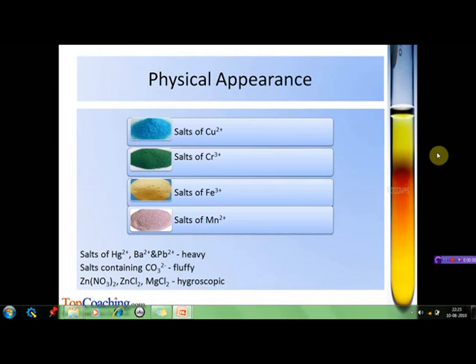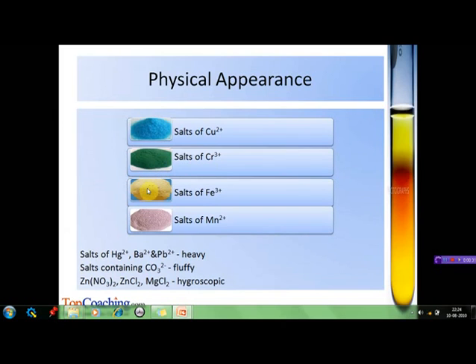The preliminary investigation starts with checking the physical appearance of the given salt. This involves examination of physical properties such as color, smell, density, etc. For example, salts of cupric ions are blue or bluish-green in color. Salts of chromium ions are usually dark green. Salts of ferric ions are yellowish-brown. Salts of manganous ions are light pink and earthy. Salts of mercuric, barium, and lead ions are heavy. Salts containing carbonate group are generally fluffy. There are also salts such as zinc nitrate, zinc chloride, and magnesium chloride which are hygroscopic and start absorbing moisture when kept in air.